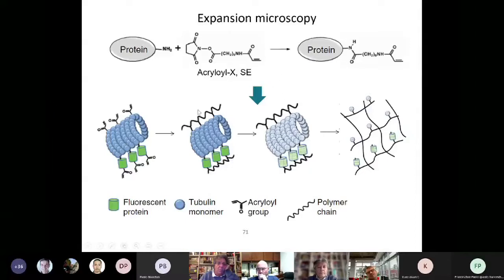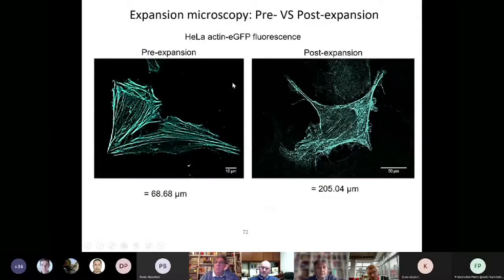Key molecule to do this is this molecule over here with typical linker chemistry that we know from labeling. It's that way that you anchor the proteins of interest or the molecules of interest into the gel. It works. This is some work we did in the lab.